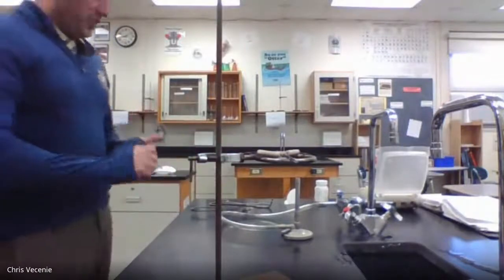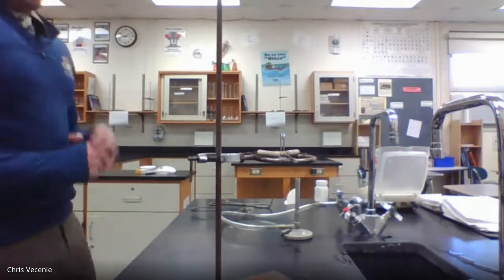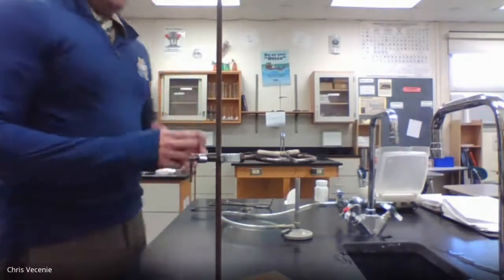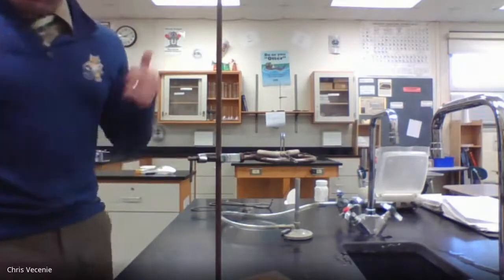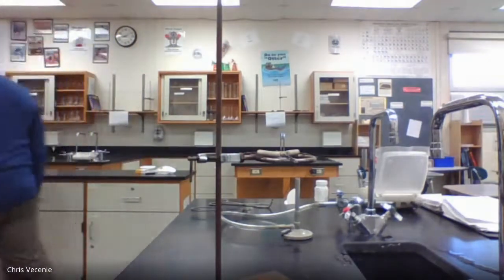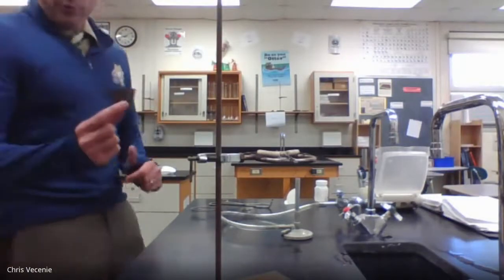So the first thing that we want to do is we need to get ourselves a crucible, all right, so that we can dry this substance. All right, so the first thing I'm going to do is go into a lab drawer. Going to get myself a crucible.